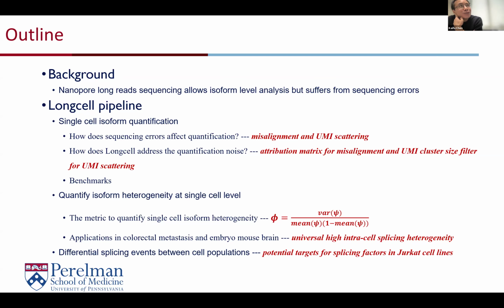I'm not sure whether it's possible, but let's say you have 500 high intercell heterogeneity sites and 500 intracell heterogeneity sites, then you analyze their enrichment in the targets of each regulator. That might provide some biological clue to explain it.